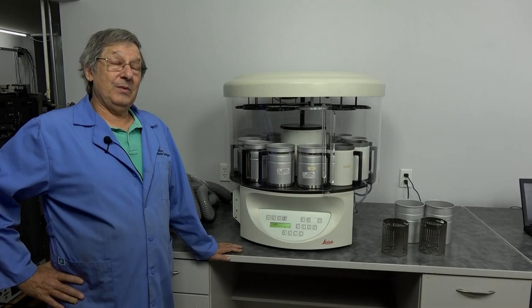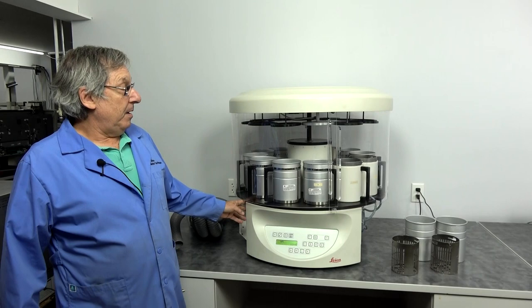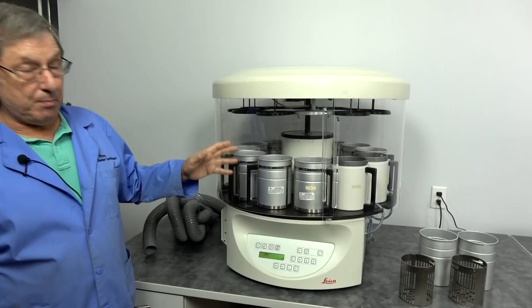Today we wanted to introduce you to the Leica TP1020 tissue processor. Unlike the more traditional vacuum tissue processor, this is a rotary tissue processor. It brings the sample to the reagent rather than the reagent to the sample.